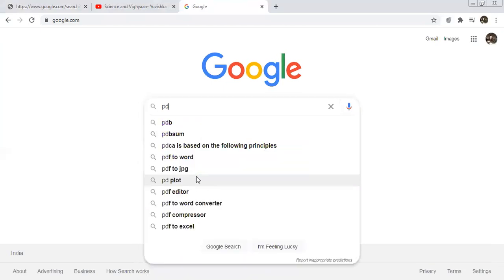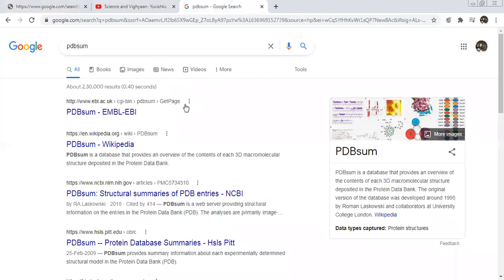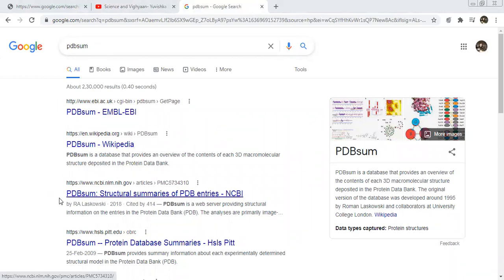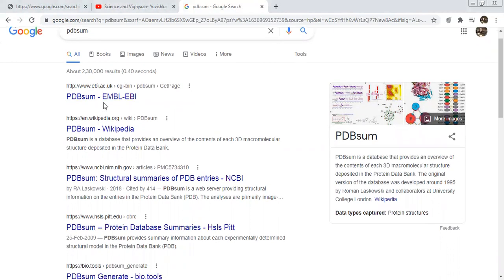I will obtain a PDB file. This is PDBsum — this is an exclusive site that is used to obtain your Ramachandran plot. Just open Google and type here 'PDBsum'. It opens like this — open the first link.